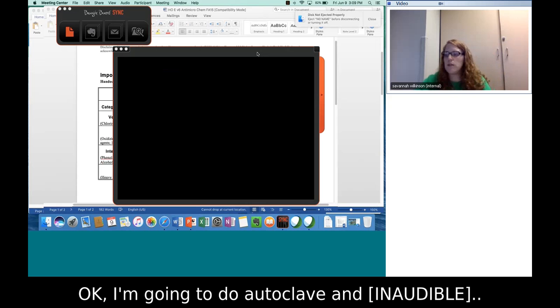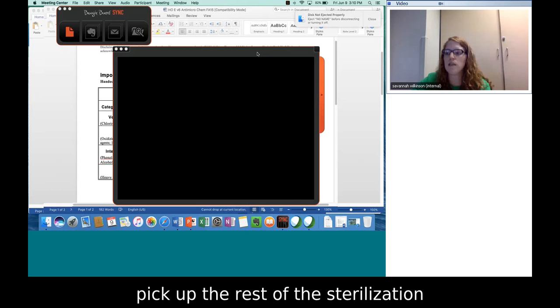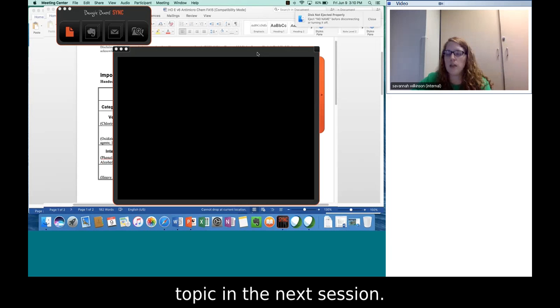Okay, I'm going to do autoclave and pasteurization, and then I'll be out of time, and I'll pick up the rest of the sterilization topic in the next session.